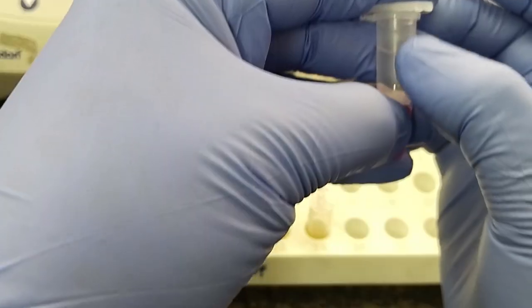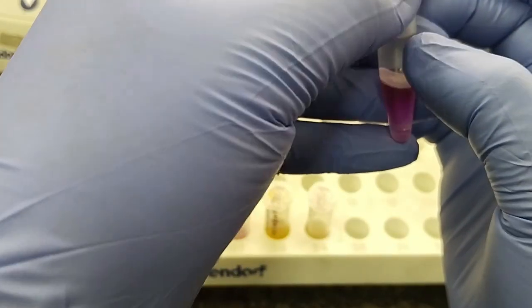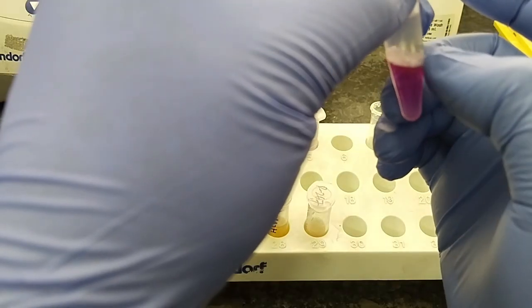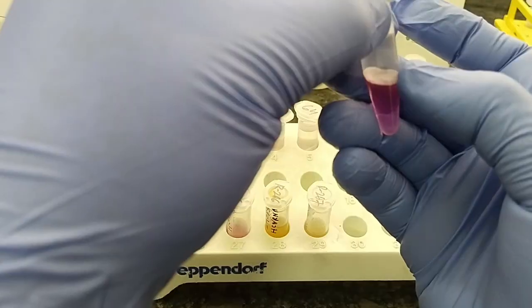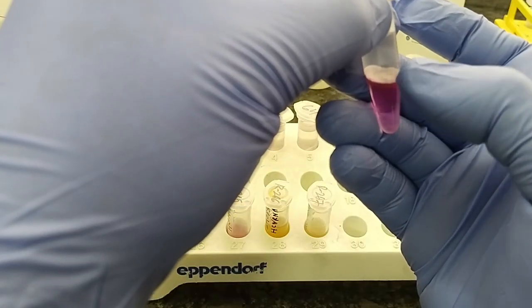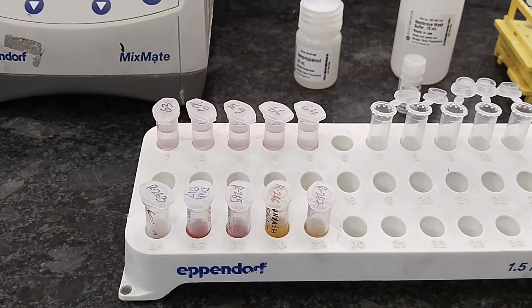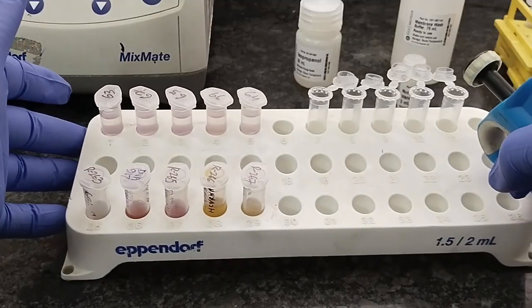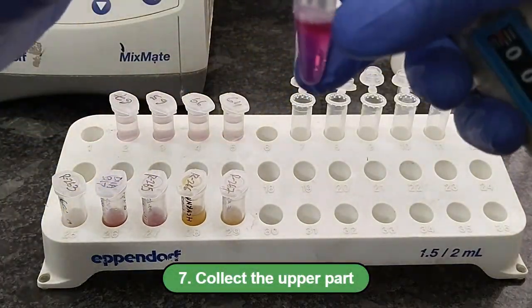RNA is extracted to the top aqueous phase, and DNA evolves as the interface. This is the interface. Here all the DNA may be settled. So now we have to collect only this aqueous phase.